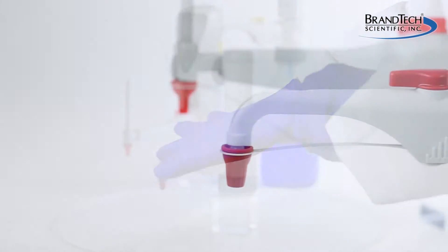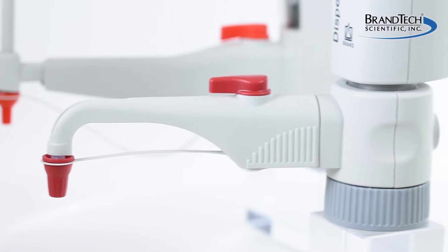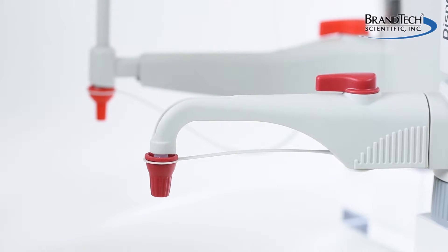The new Dispenset S and Titret incorporate an innovative quick connect discharge tube that eliminates seals and potential leak points.